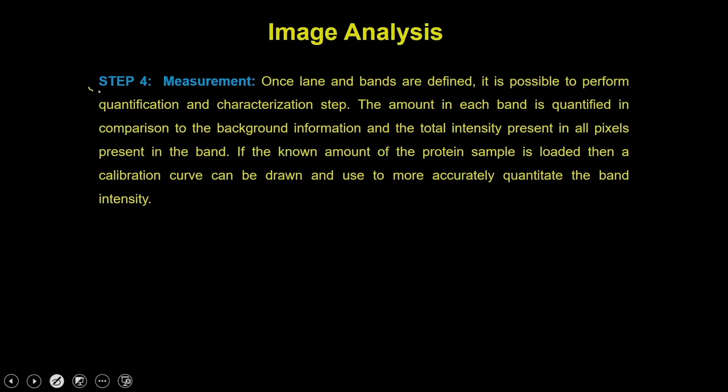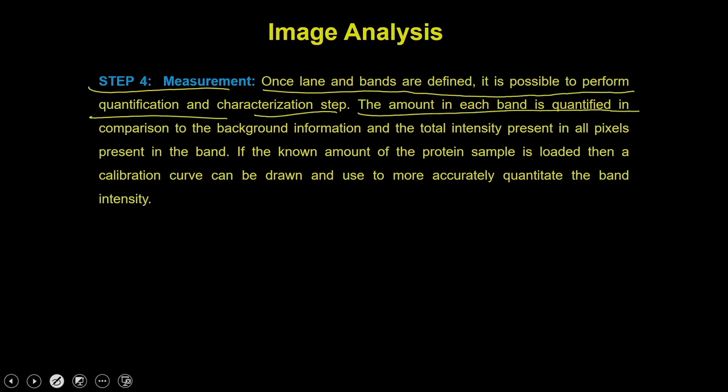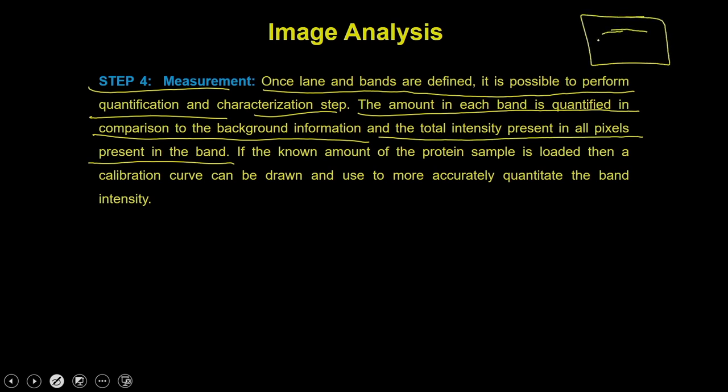So the next step is the measurement step. Once the lanes and the bands are defined, it is possible to perform the quantification and characterization steps. The amount in each band is quantified in comparison to the background information and the total intensity present in all pixels present in the band, which means if you have a band, you are going to get the intensity of each and every pixel of this band, and that intensity will be in relation to the background in the surroundings of this particular protein band.